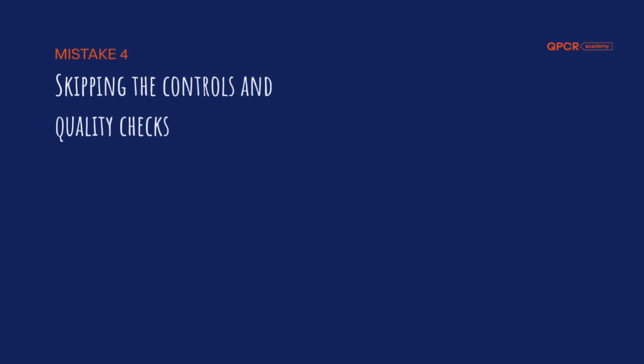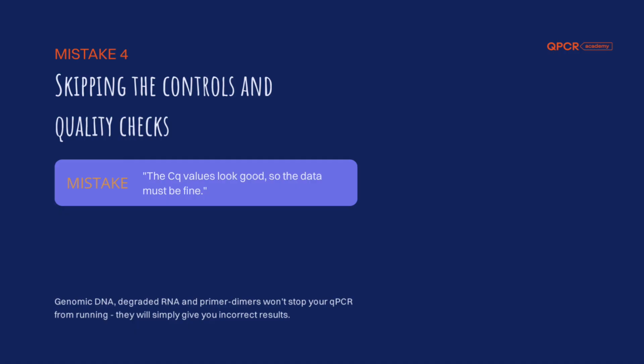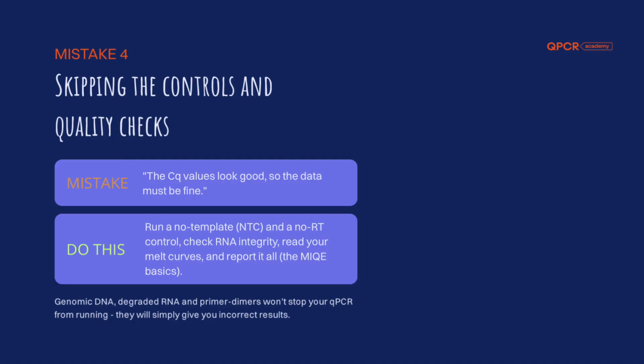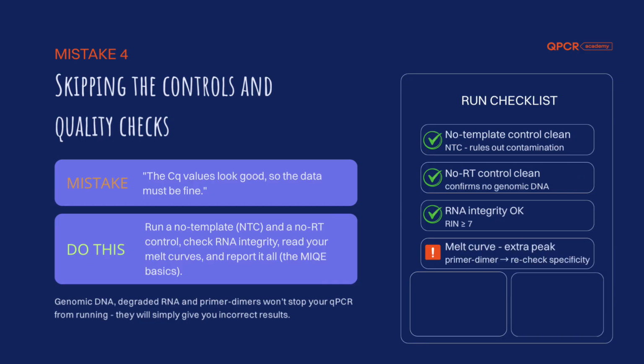The fourth mistake is skipping controls and quality checks simply because the CQ values look fine. Genomic DNA contamination, degraded RNA, and primer dimers don't produce an obvious red flag. They simply shift your numbers quietly. Run a no template control and a no RT control, assess RNA integrity, and inspect your melt curves carefully. You should see a single clean peak, not 2. 2 peaks in your melt curve indicate primer dimers or unspecific amplification, for example from residual genomic DNA. This is the baseline set by the MIQE guidelines, and it's what separates a result from a reliable result.